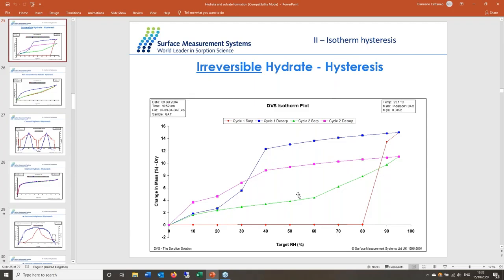Okay, thank you again. A question here from Mitul Kumar Patel. Does the final Raman have any background subtraction for the aluminium pan of DVS?